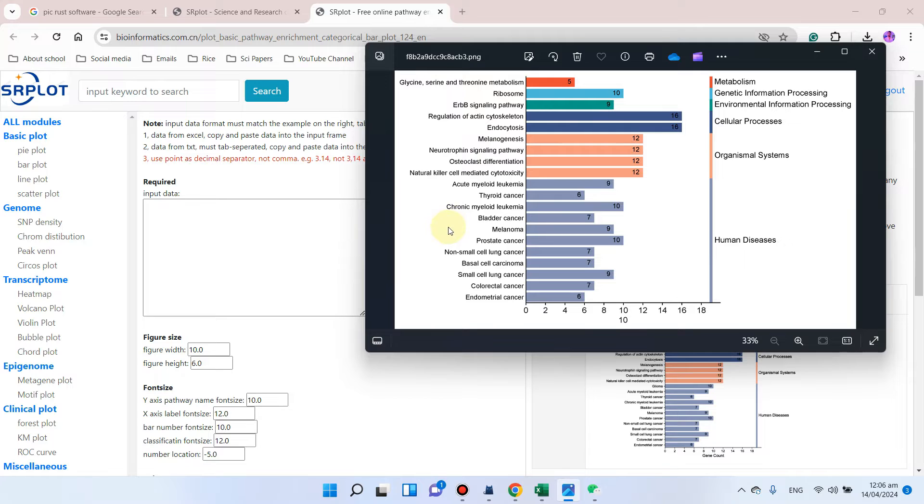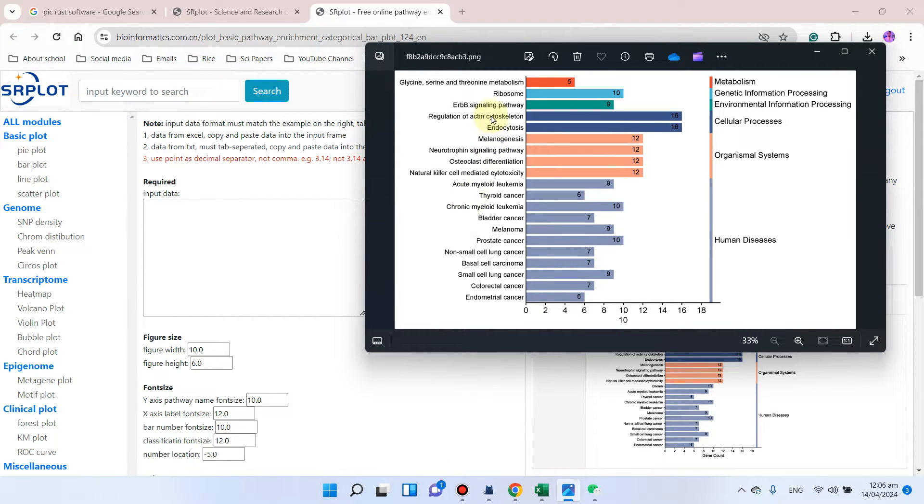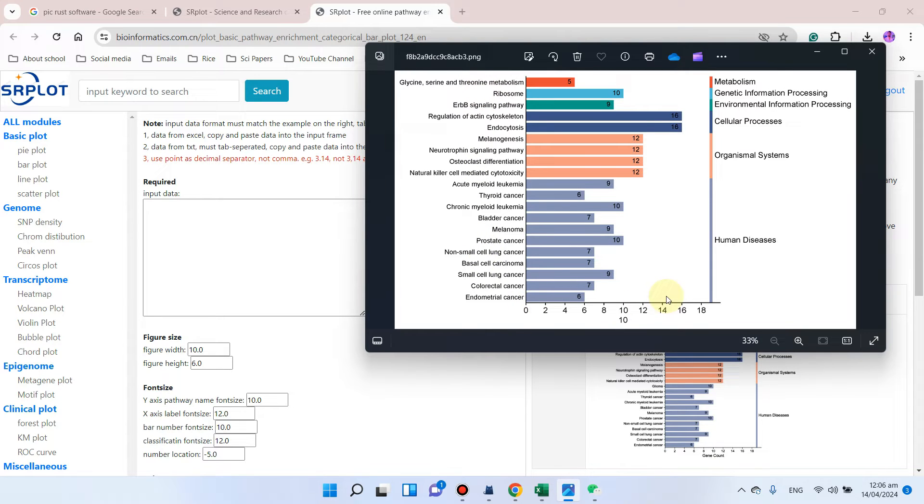Welcome to another video tutorial. In this video, I will show you how we can create KEGG summary plot using only KEGG pathway names and gene counts.